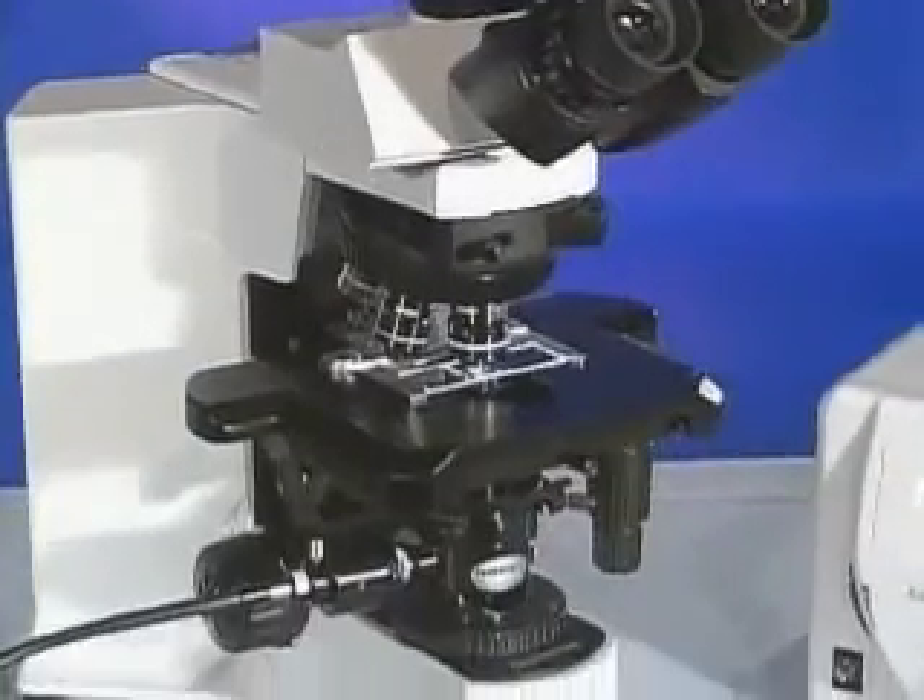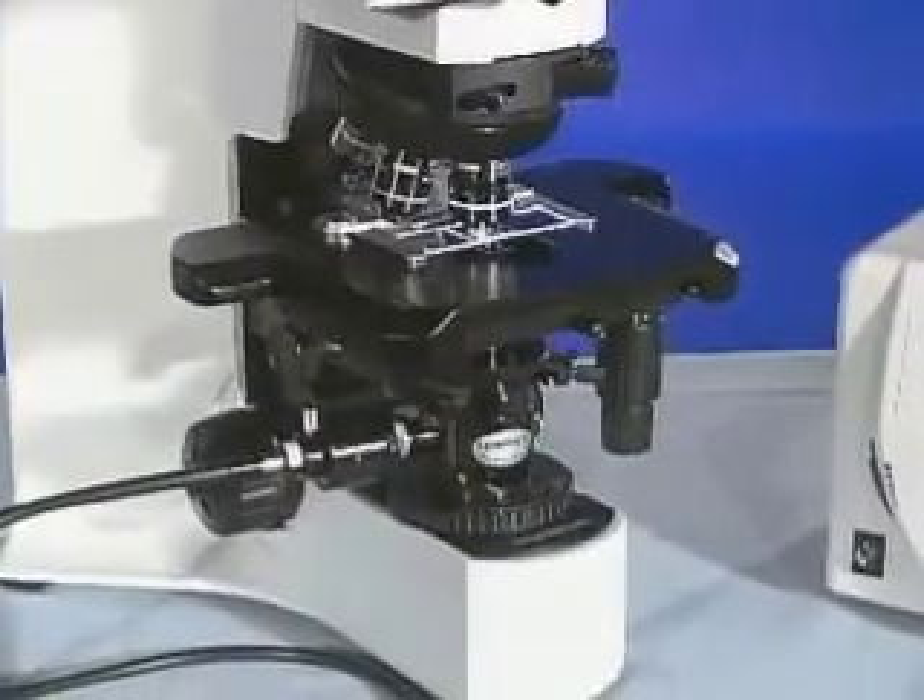This brief video demonstrates how to set up the CytoViva Fluorescence Imaging System.